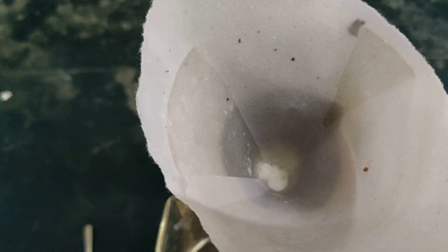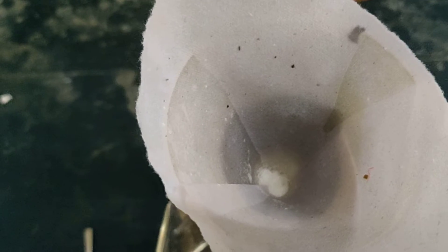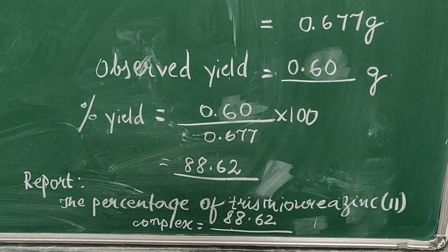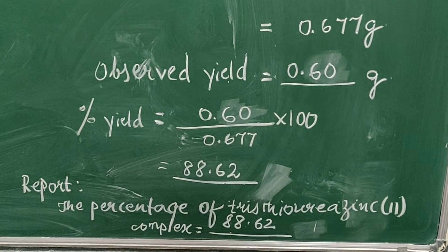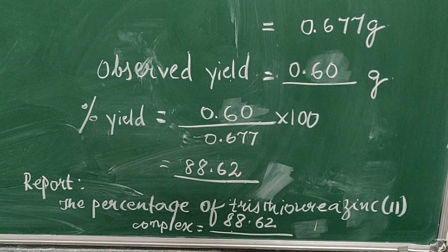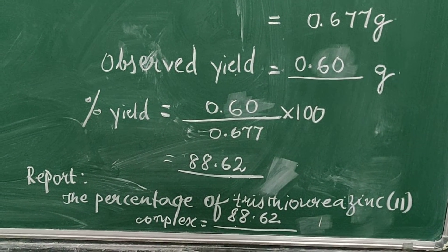After this I am going to remove it, dry it, weigh it, and then we shall look at the calculation part. After weighing the complex, the observed yield was 0.6 grams. Hence the percentage yield was found to be 88.62.